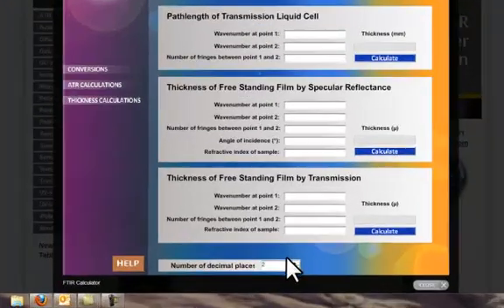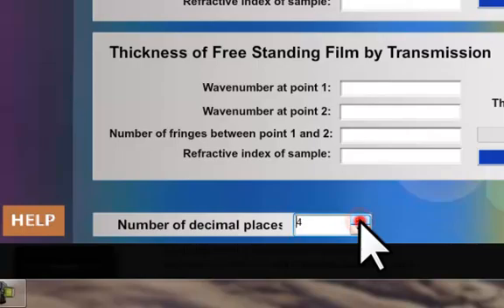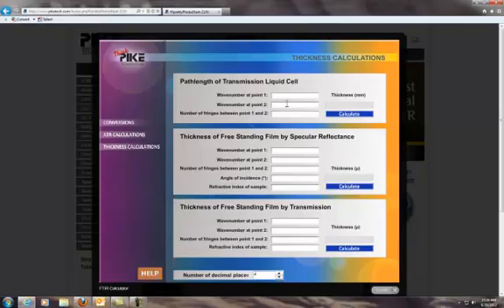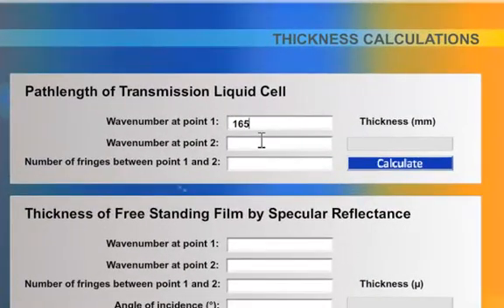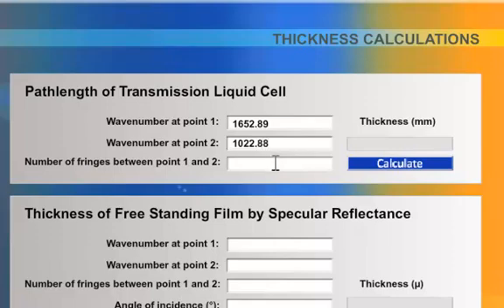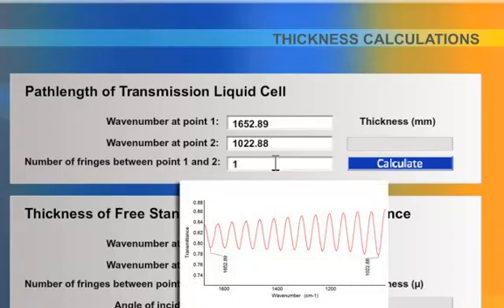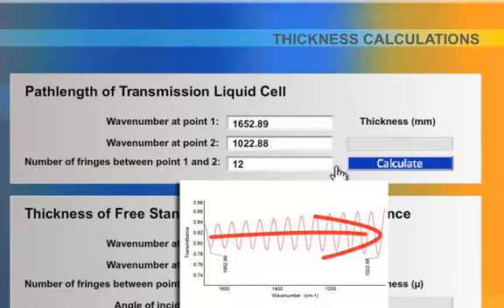First, I'll change the number of decimal places for the calculated answer. Next, enter the wave number for the first fringe: 1652. And for the second fringe: 1022. From the spectrum, count the number of fringes between these two points and enter this value — twelve fringes in this spectrum.